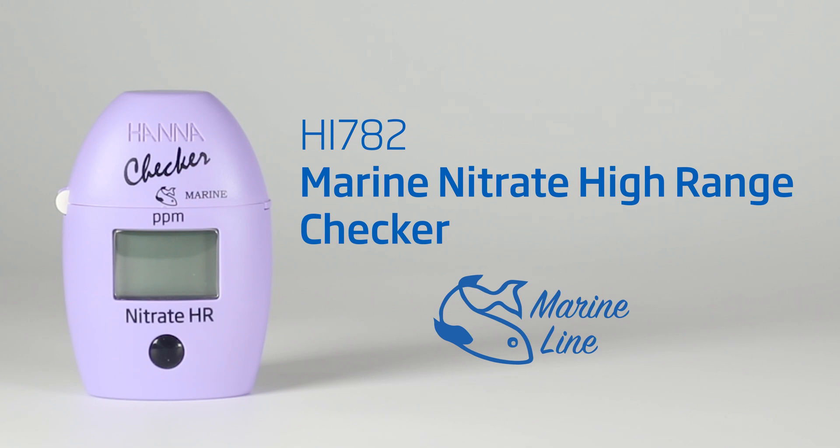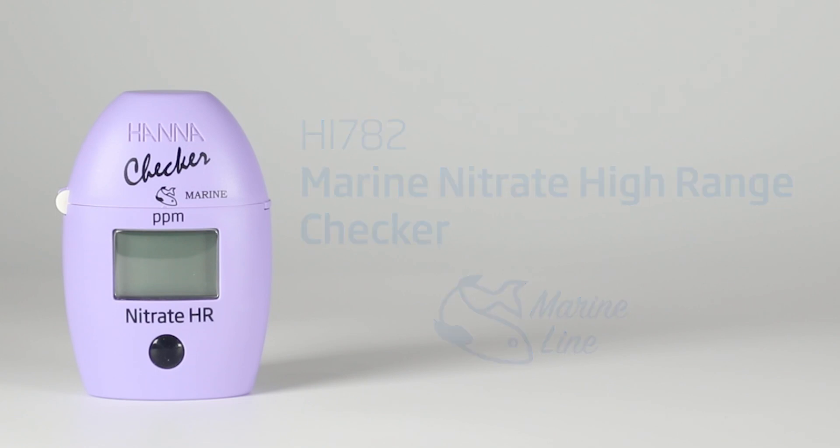The HI782 Marine Nitrate High Range Checker is perfect for measuring nitrate levels in saltwater aquariums and marine environmental testing. It has a digital readout for easy viewing and its compact design fits in your pocket.